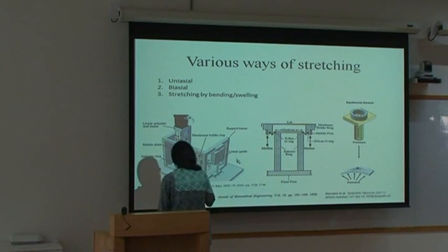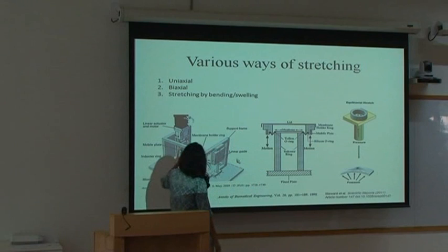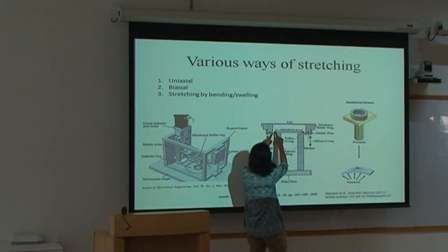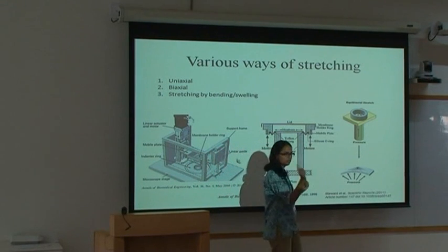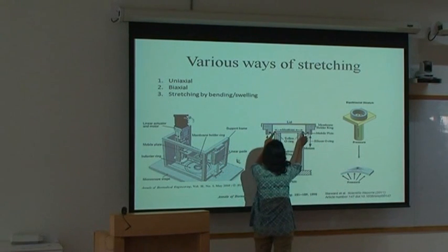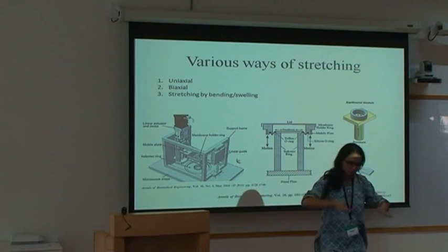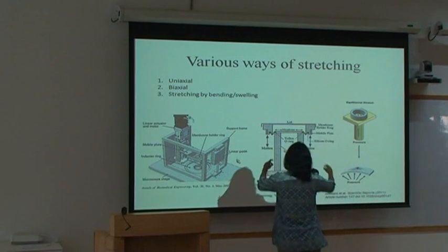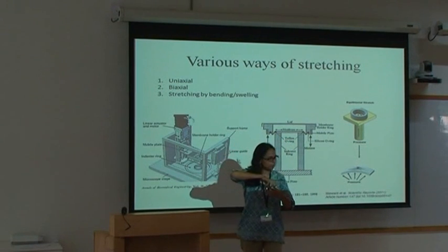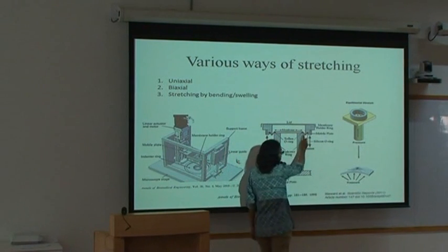This is a nice way that people have done. People use this, and this is another modification, 98, 2010. This looks better, and you can do better imaging through it. Here, basically, you have a membrane which is on a circular surface, on a ring or a tube, and you have another ring, which is the O-ring, on which PDMS can slide. So you put a sheet of PDMS. You come with something which can screw on it, to which you can attach the PDMS. Not that you're screwing it; there are no threads there. It's all free here.